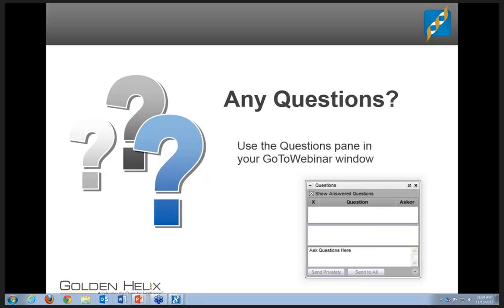Okay. Are we planning to incorporate SKAT into SVS anytime soon? Okay, so that is a great question. And looking through the list here, it looks like several people have asked a similar question. And here's what I am authorized to say, which is that we are definitely reviewing some options for updating our collection of collapsing tests.